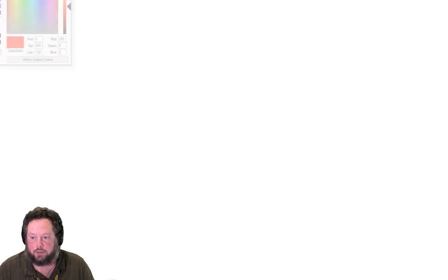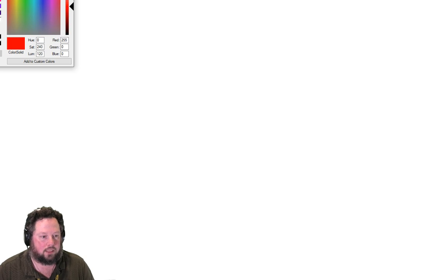All right, so if we've got time, we'll get back to the ano-rectal junction. We'll finish off our look there. So bear with me. What I'm going to try to do is do some drawing. I think it's a bit easier to explain what's going on here. So let's use a different colour. We'll just start with black first.